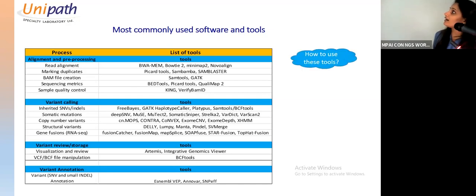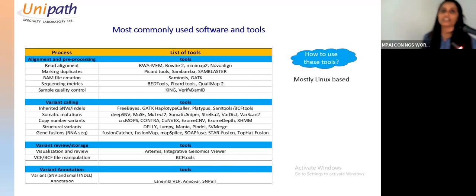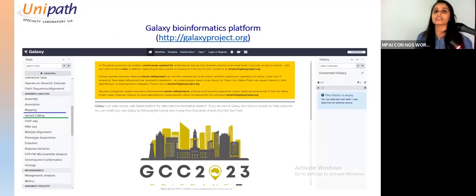So how to use these tools? Mostly they are Linux based. With this knowledge, which is actually a very typical implementation, when you look at the screen of a bioinformatics person and sit beside them, you'll feel it's very boring. But for bioinformatics, it is actually very interesting.